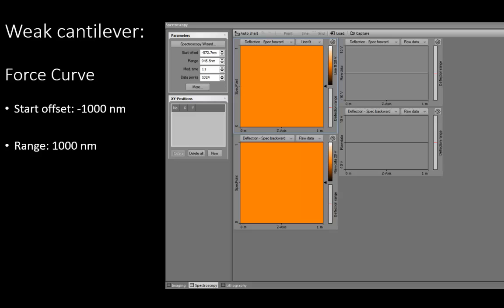After you are done with imaging, go to the spectroscopy window. Click load to bring in the image you just obtained. Set the scan to deflection spec forward and backward and the filter to raw data. Input the values of start offset and range at negative 1,000 nanometers and 1,000 nanometers respectively. Set the position of the point over which you want to obtain the force curve and click start.